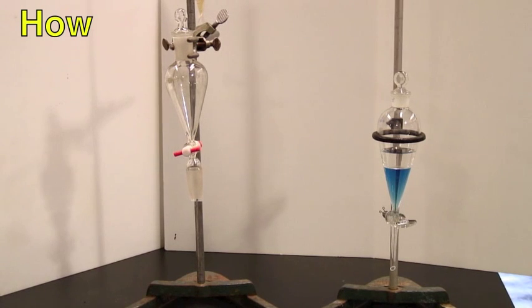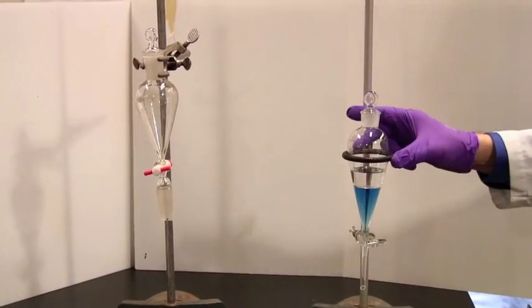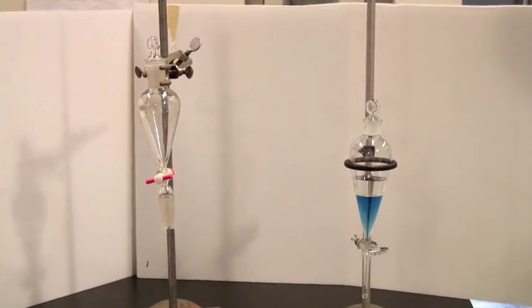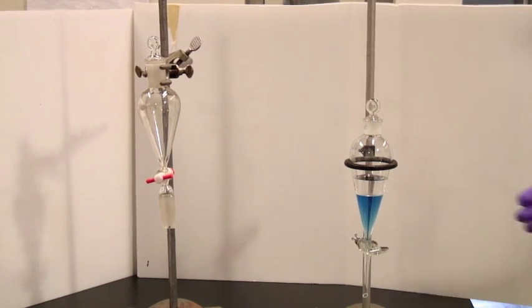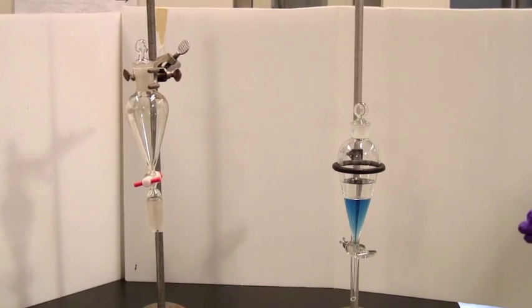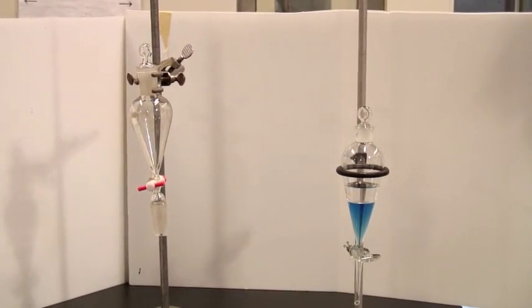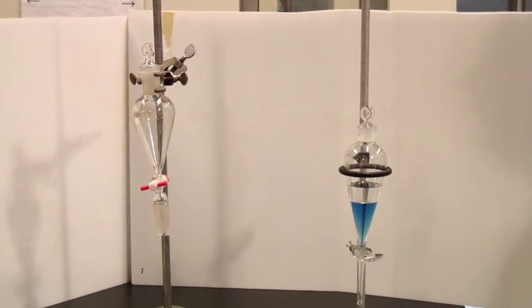Separation of two phases using a separatory funnel is more simple than microscale because you don't need droppers. All you need is a separatory funnel with its lid and either a clamp, a three-finger clamp, or a ring stand, as you see here. Clamp the funnel upright and let the two phases settle and separate out. You'll then need a container so that you can catch whatever drains out.